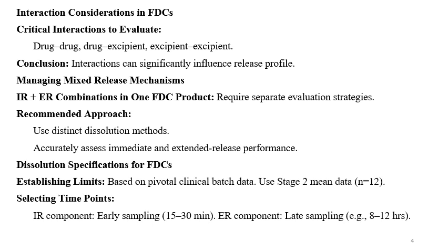Separate dissolution methods are required to be developed. These types of dual release mechanism products require separate evaluation strategies. The recommended approach for this type of formulation is to use distinct dissolution methods so that you can justify the discrimination. Also, it is recommended to accurately assess the immediate and extended release performance of the formulation.